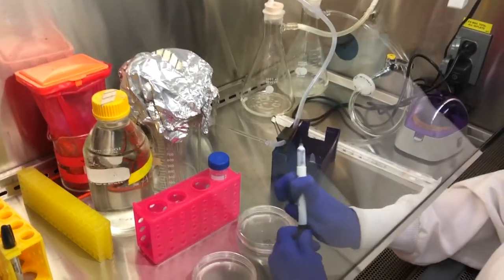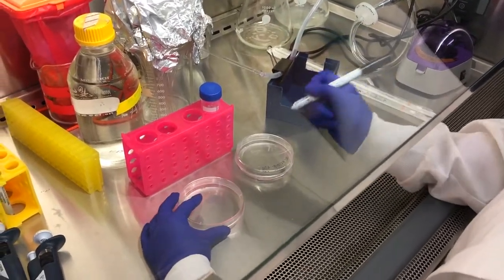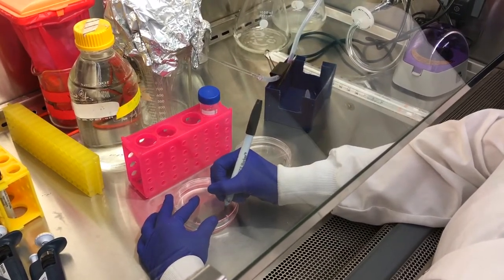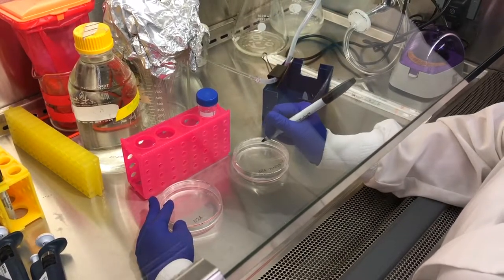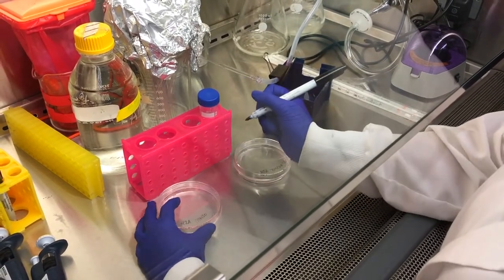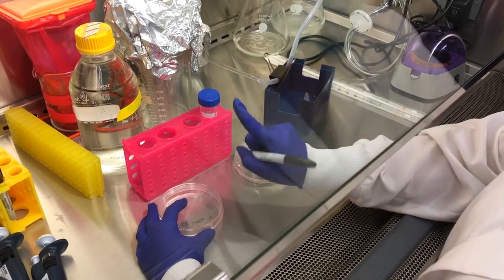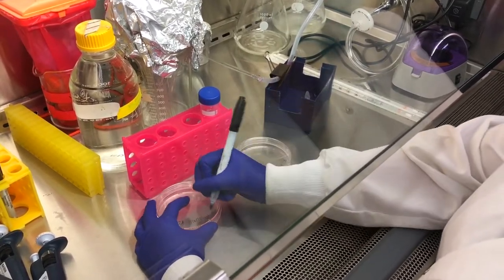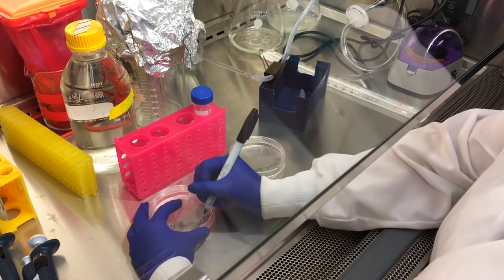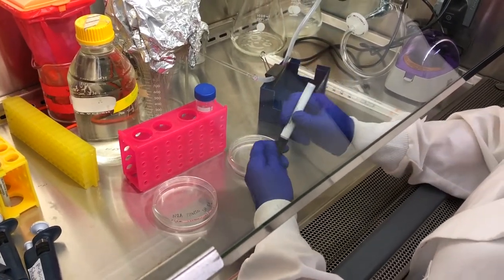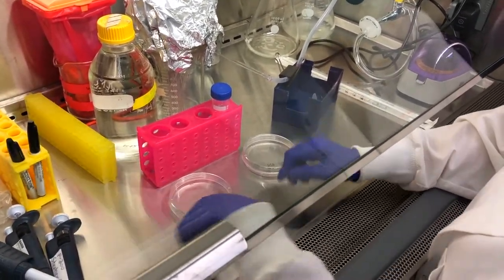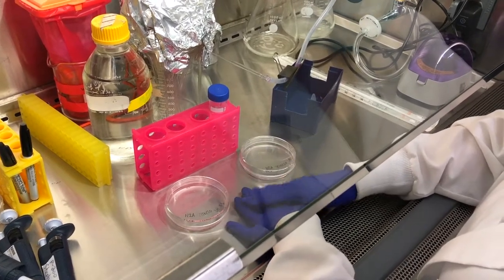And you're going to label your new plate. You want to label the cell type. And we are using N2A cells. You also want to label today's date. And you want your initials and the passage number. So we're going to put the letter P for passage. And this is our first passage. So I'm going to put number one. So whenever you do another round of cell passaging or cell splitting, you want to update your new plate with the date and the passage number.